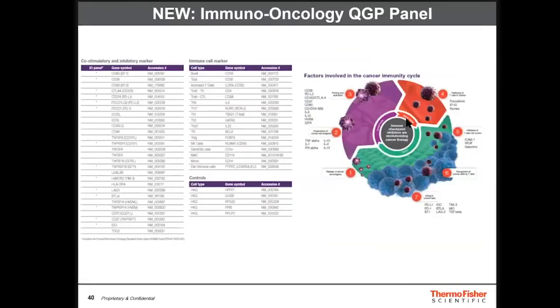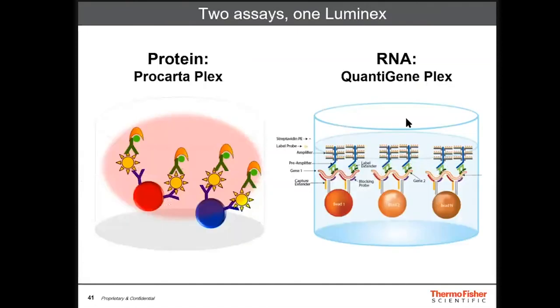And, up till now, we've been talking about the Luminex assay for RNA. It works also for DNA. We're not even going to talk about that today, but sample preparation is a little bit different. We degrade the RNA, open up the double helix, and then we can look at... 5 minutes left. Oh my gosh. Okay.